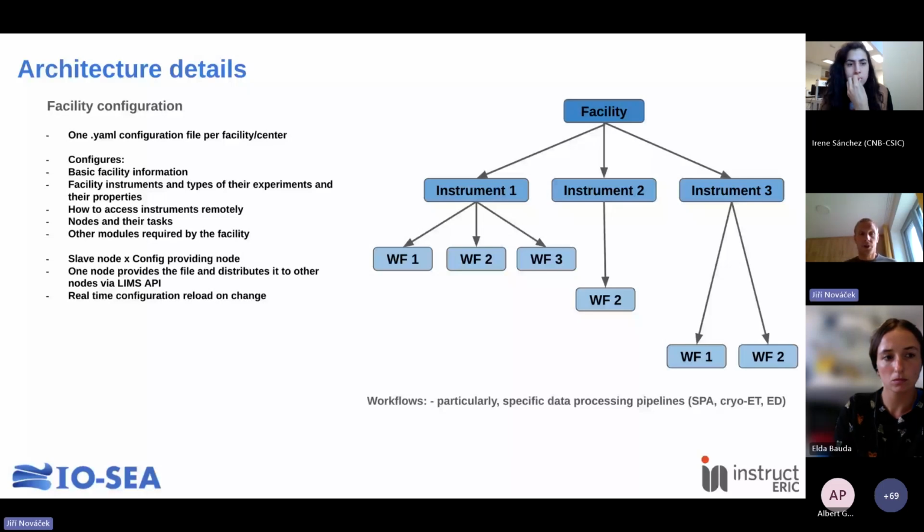So the standard configuration is performed through a single configuration file. We use a YAML format. So it is a single YAML format that configures how the facility and all its resources are set up. For each facility, we can define multiple instruments, and if needed, each instrument can have its own workflows. These workflows are particular workflows related to data analysis. So in the case of EM, this would be either single particle or tomography or electron diffraction, for instance.